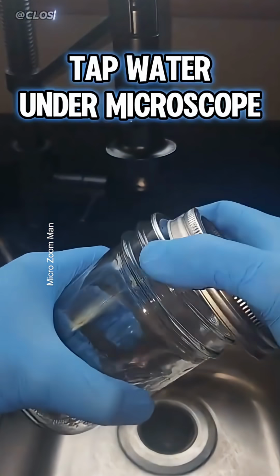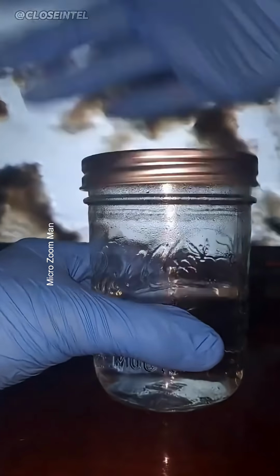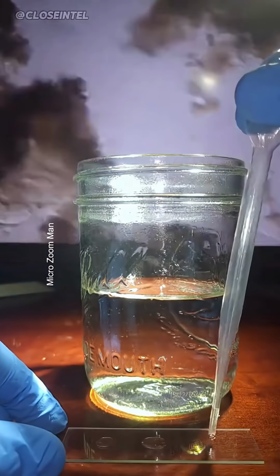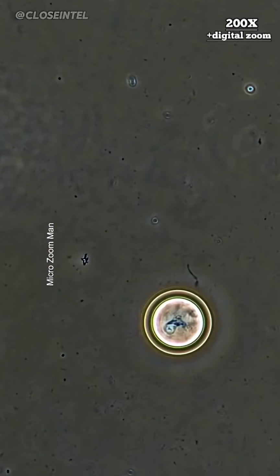Have you ever wondered what's really in your tap water? Well, today we're going to take a closer look. Using a microscope, we'll examine a sample of tap water from my faucet and see what we can find. To prepare the sample, I let the water sit for a bit, allowing things to settle and concentrate.